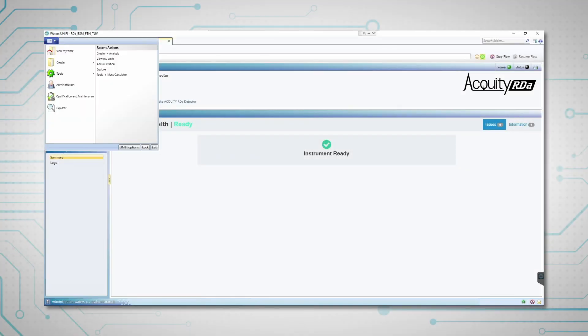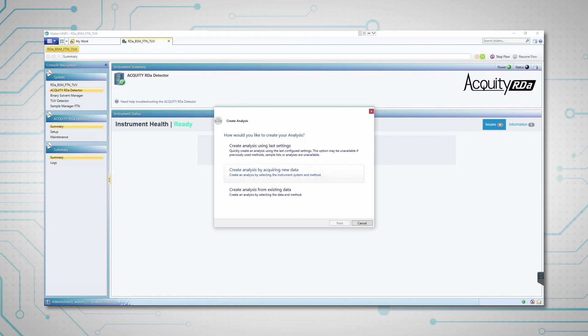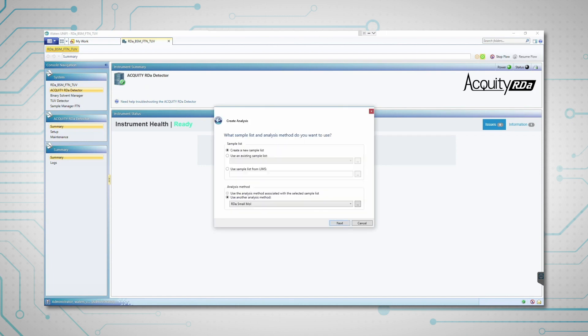To acquire data, users create an analysis using a predefined method for sample submission, acquisition and processing.